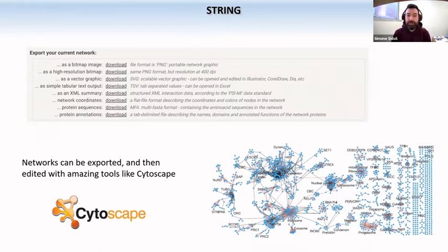You can upload them in free software, for example Cytoscape, where you can start playing with the aesthetics of your network. Cytoscape, to the best of my knowledge, is the best free software to help you organize your data into networks. We don't have time today to discuss how to use Cytoscape, and I'm sure there are other videos where they explain it better than me. But just to let you know, this is a great resource to create some very nice graphs. All the ones I showed you so far were done in Cytoscape.